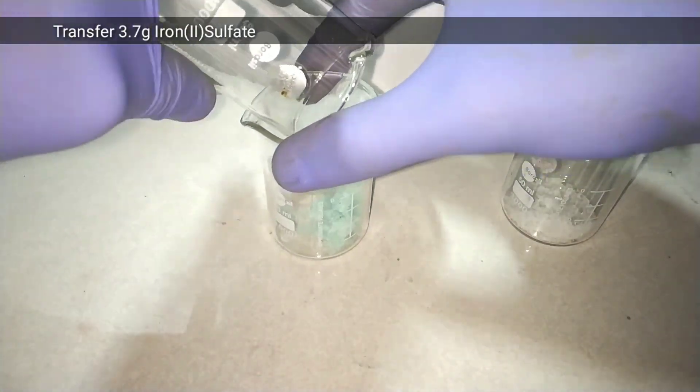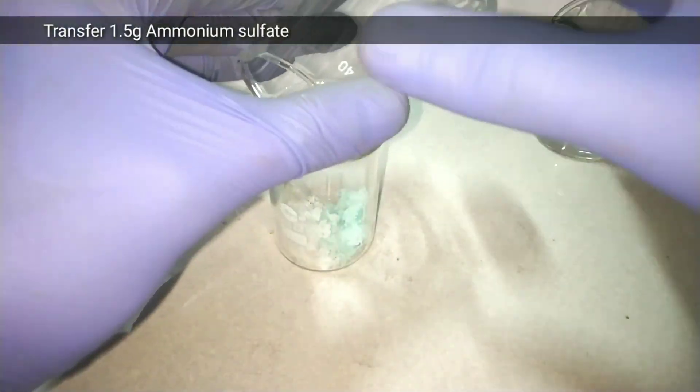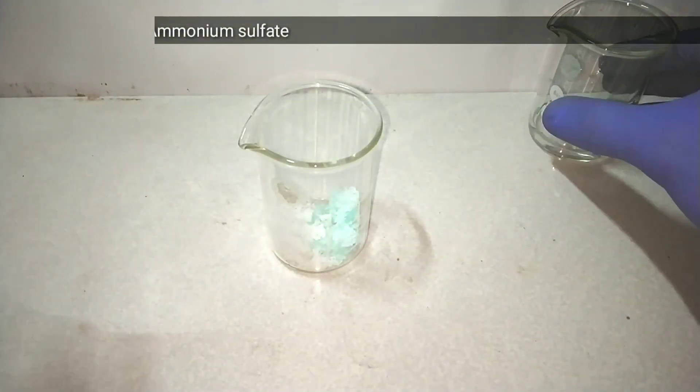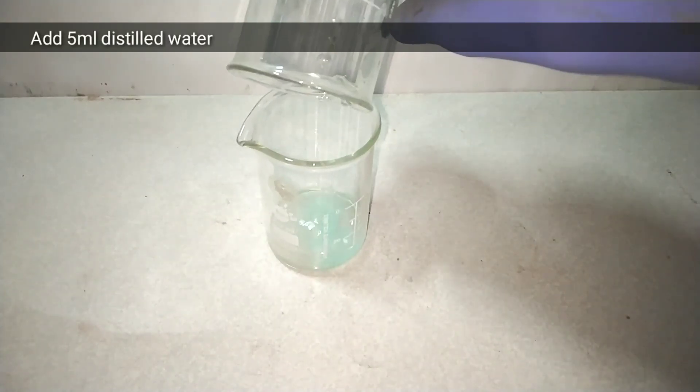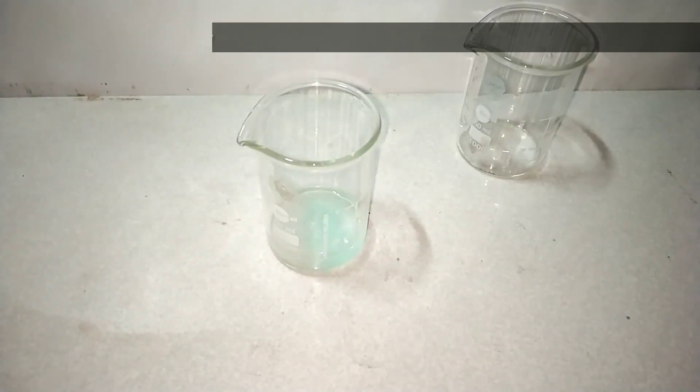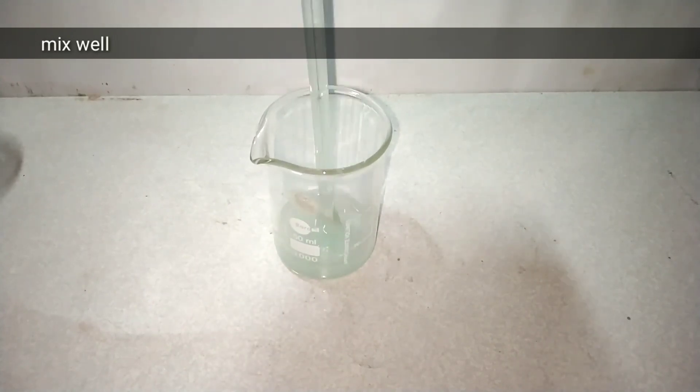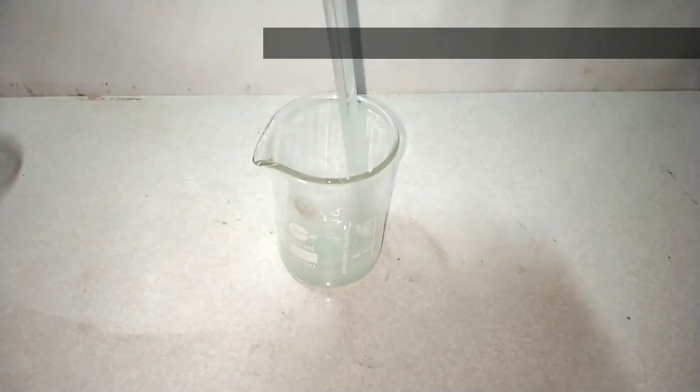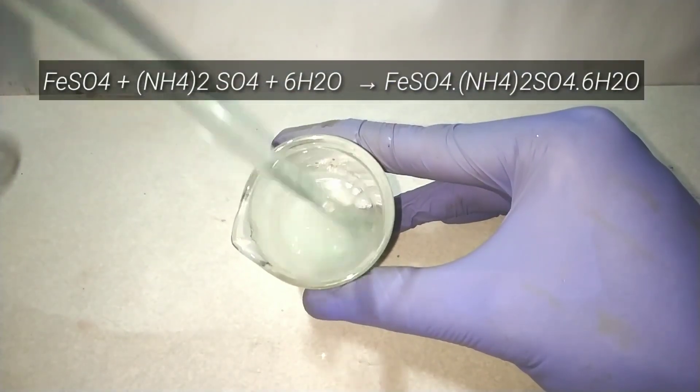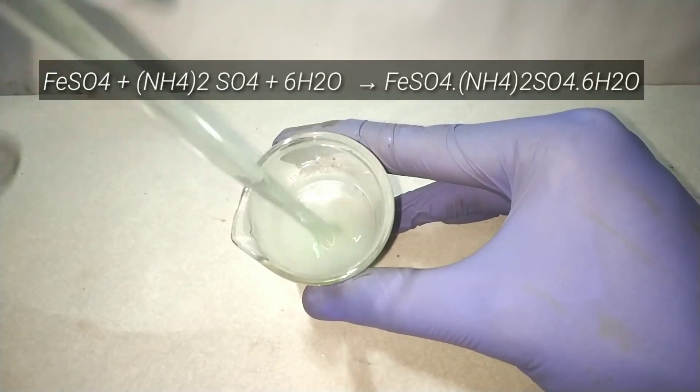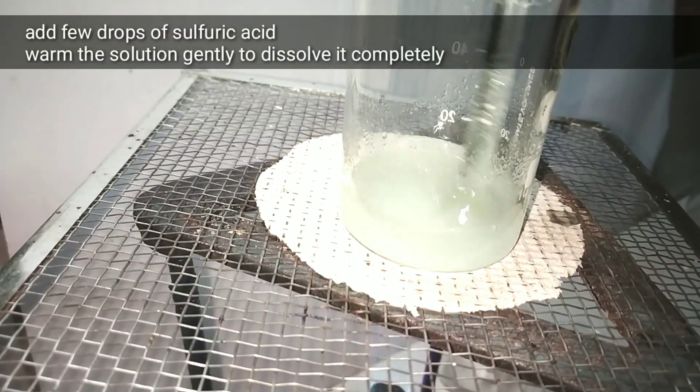First we transfer 3.7 grams of iron 2 sulfate into a 50 milliliter beaker. Now add 1.5 grams of ammonium sulfate into it. Then add 5 milliliters of distilled water and mix well to dissolve the contents. Warm the solution gently to dissolve the salt completely in the water.